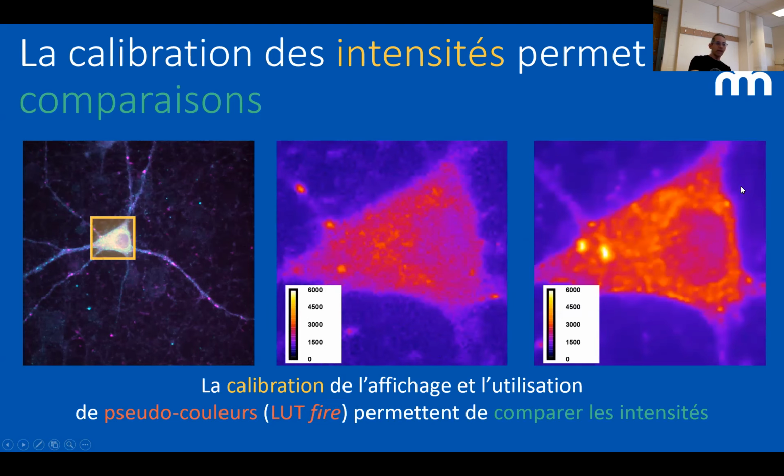And you can see that the green channel is actually much higher than the red channel when things are normalized and calibrated. So if you want to compare intensities, you need to put this thing here, so we know what the intensity is based from. And then you can call it your red channel, or you can call it whatever proteins you are looking at. And here, the other staining you are using.